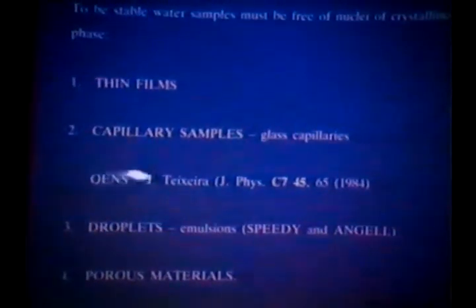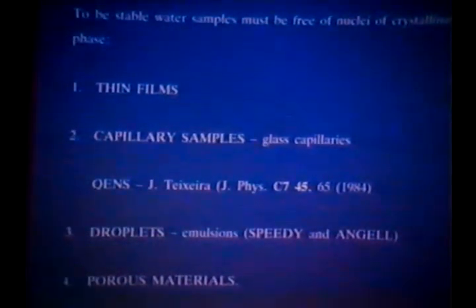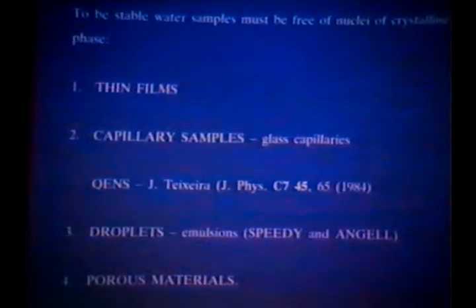Particularly we'll be concerned with the work of Teixeira at Saclay, who's done quasi-elastic neutron scattering on supercooled water in capillaries, where one can cool the water down to -20 centigrade and still retain the liquid state. We'll be concerned with these porous silicas.